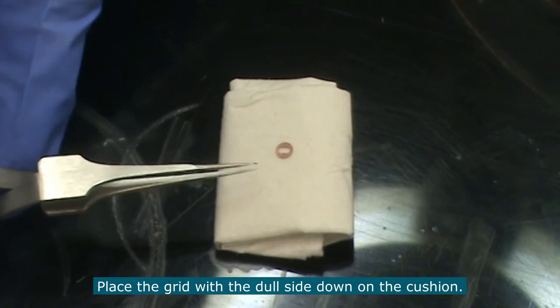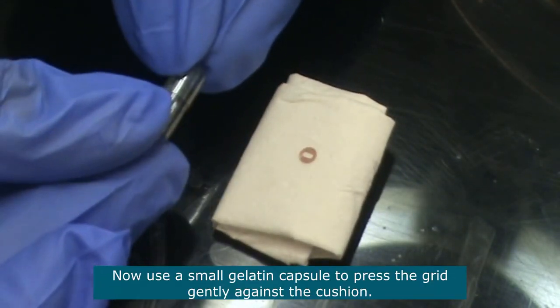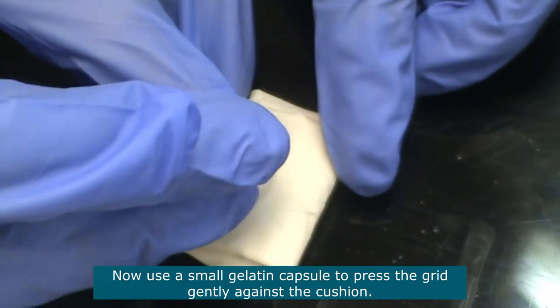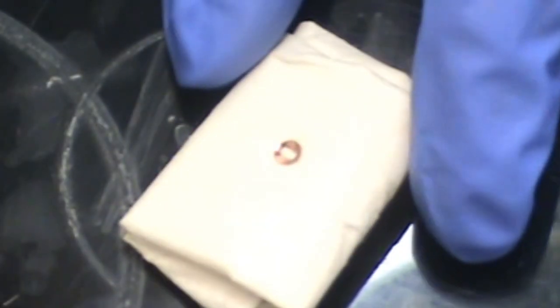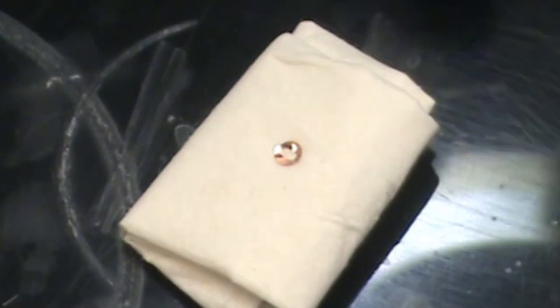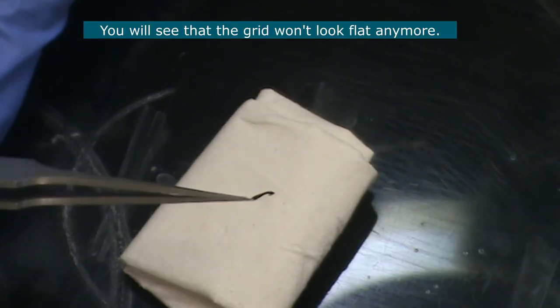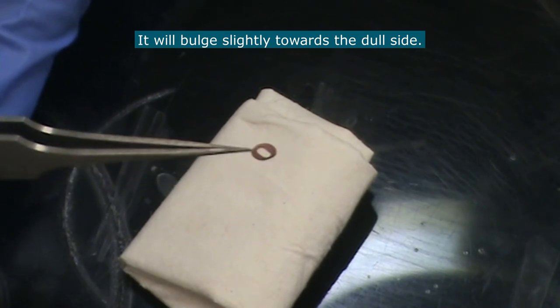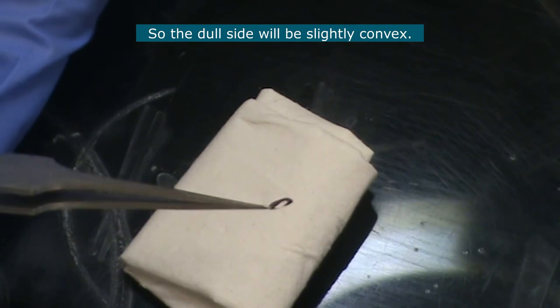on the cushion. Now use a small gelatin capsule to press the grid gently against the cushion. You see that the grid won't look flat anymore. It will sort of bulge slightly towards the dull side. So the dull side will be slightly convex.